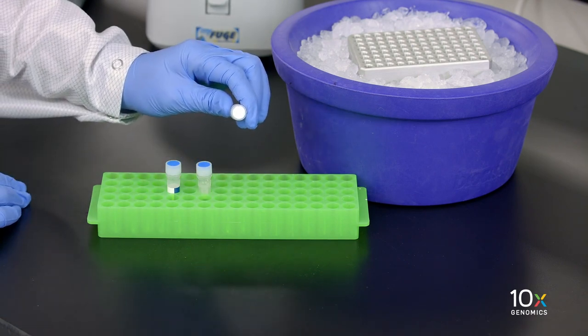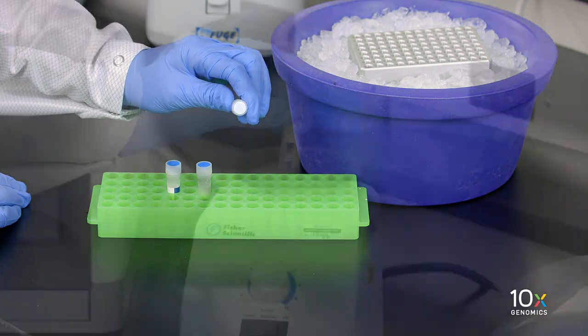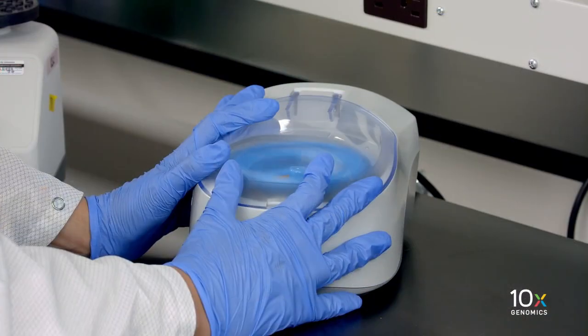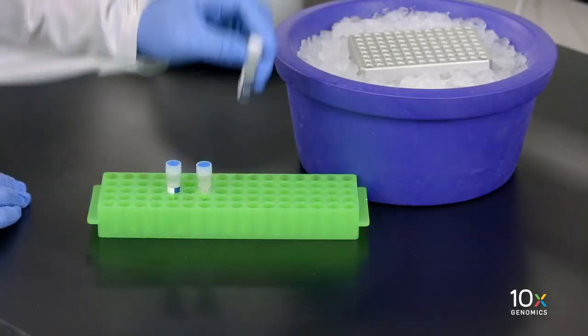Next, we have our reducing agent B. Equilibrate to room temperature, vortex, verify there is no precipitate, briefly spin down, and leave at room temperature.